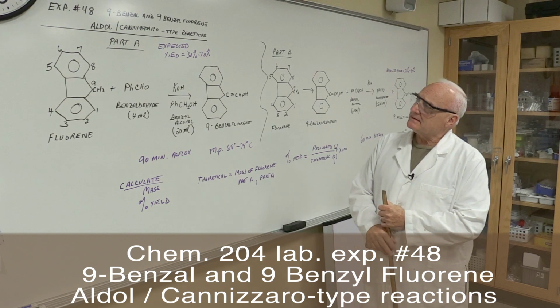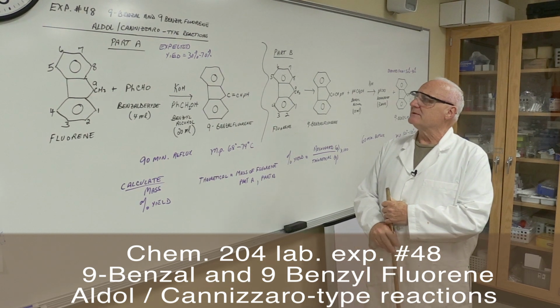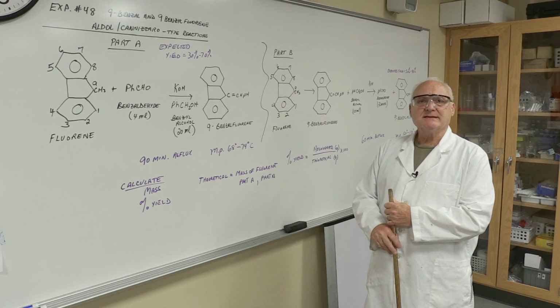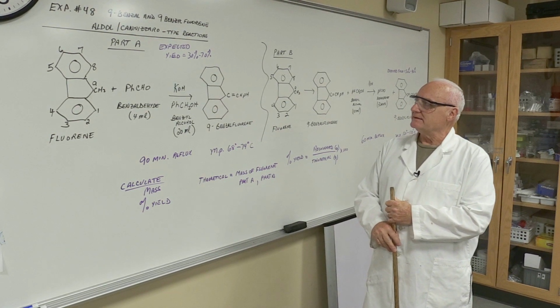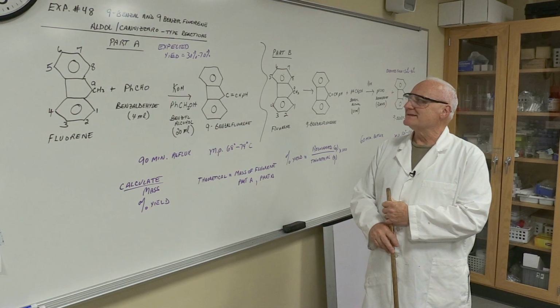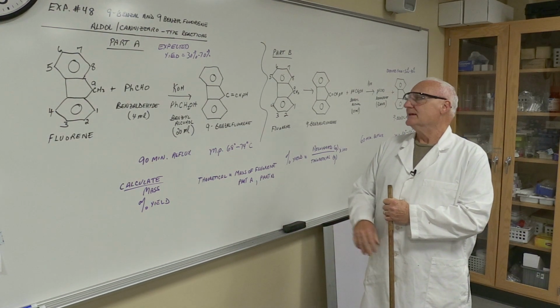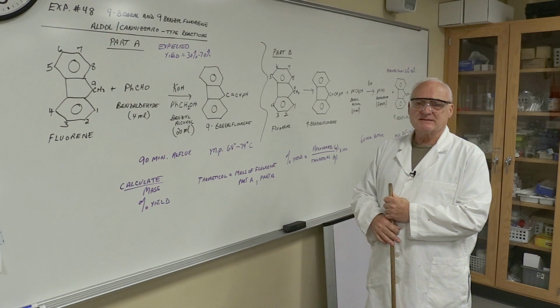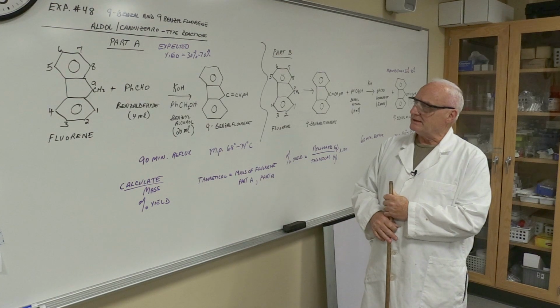Today's experiment is experiment number 48 for 9-Benzal and 9-Benzyl fluorene, sometimes referred to as the Aldol Cannizzaro type reactions. And essentially we're forming new carbon bonds, either single or double bond.